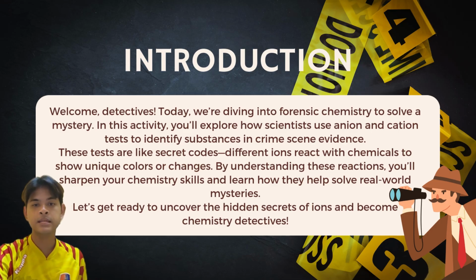So this is basically the introduction of our kit, where we need to discover the ions that are present in the forensic cases that we have imposed in our kit.